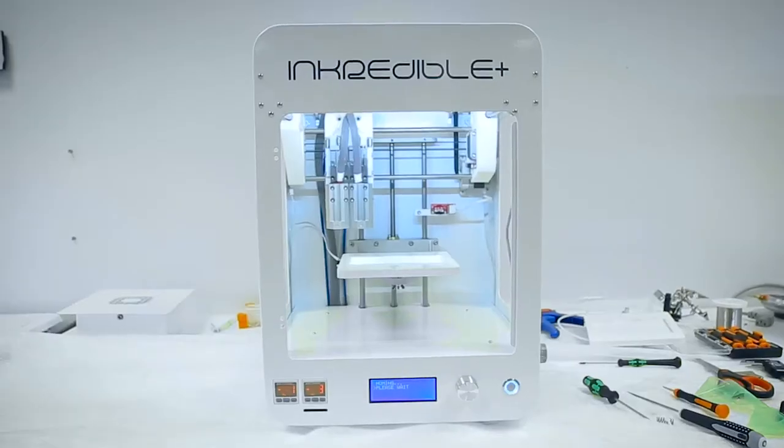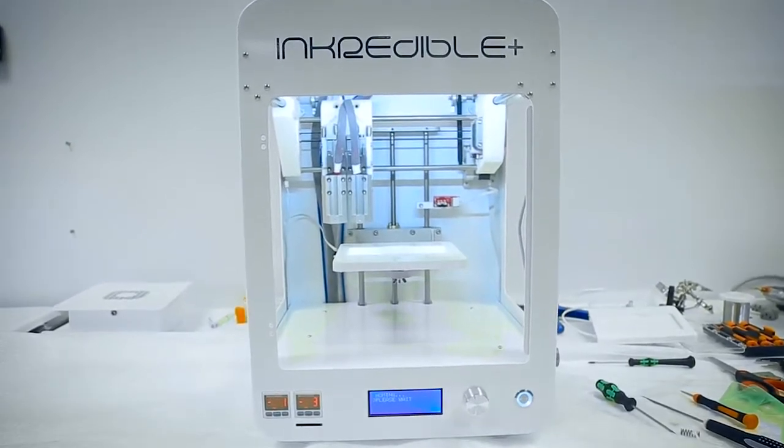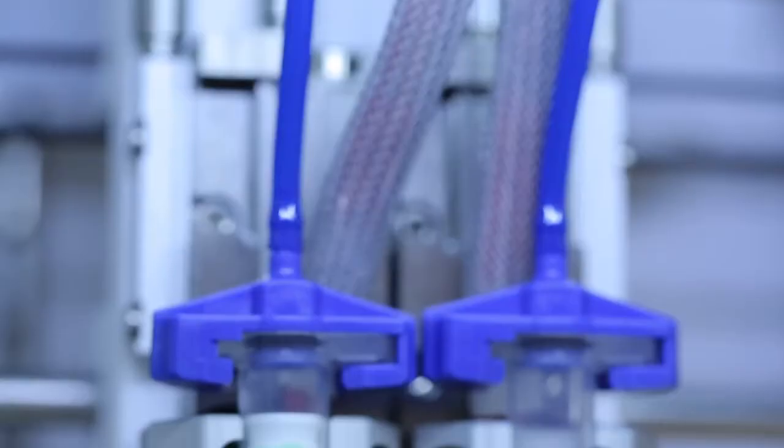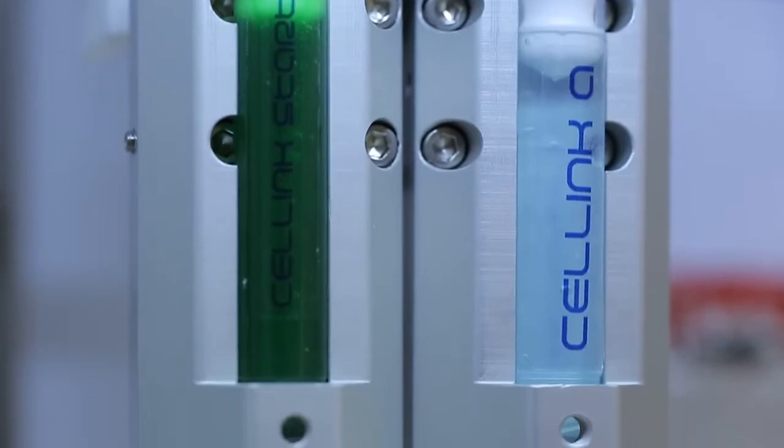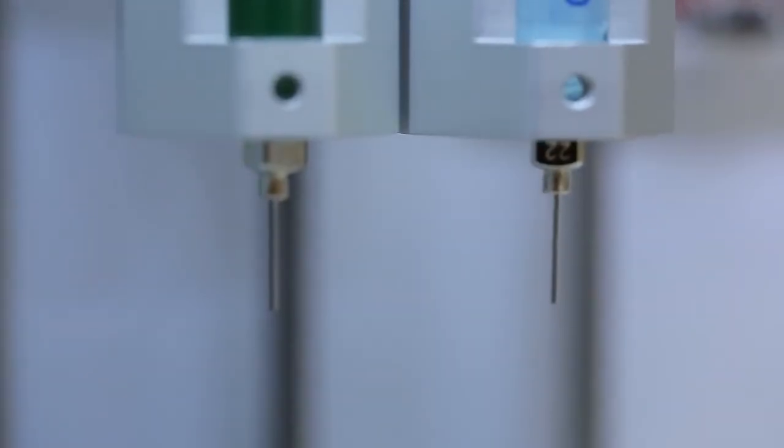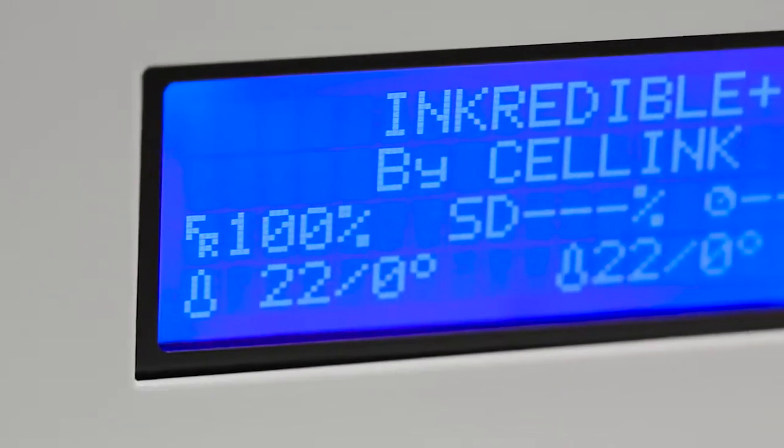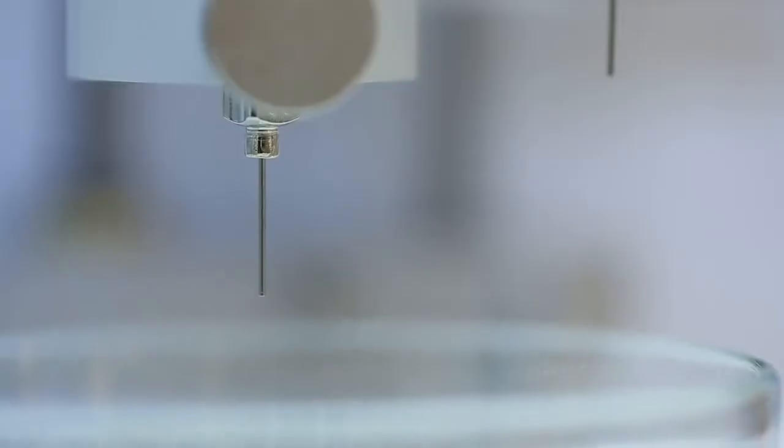With an increase in chronic diseases, an aging population, and a lack of human tissues and organs, the market for 3D bioprinting continues to grow rapidly. One of the companies at the cutting edge is Gothenburg-based company Cellink, who is now preparing a full-scale expansion.